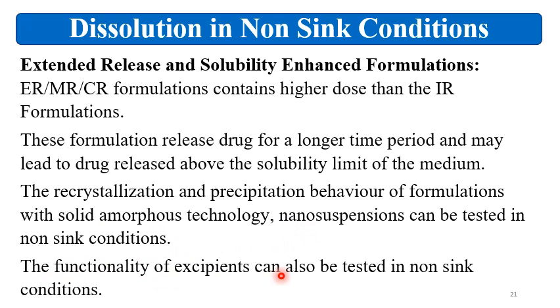The functionality of the excipient can also be tested in non-sink conditions. If you are making a solid amorphous dispersion and you want to check the functionality of the polymer to have impact on the solubility, then non-sink condition can give more information about the excipient performance.